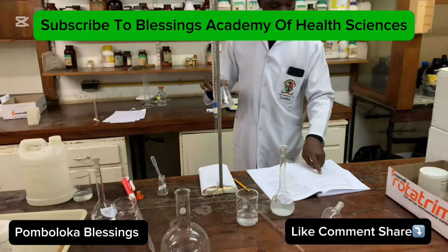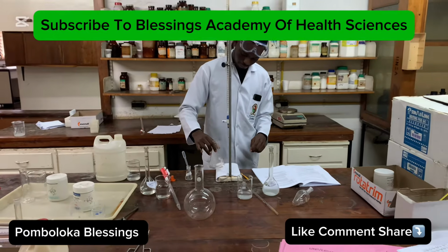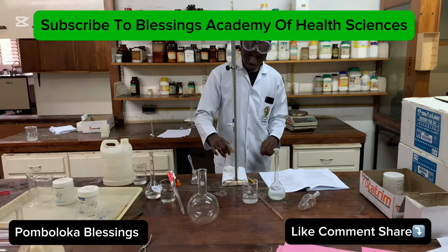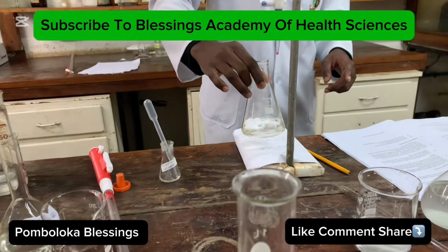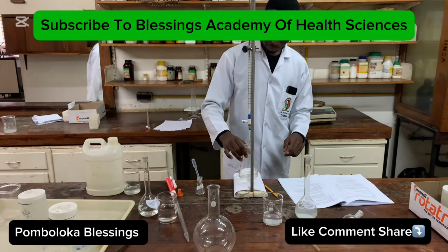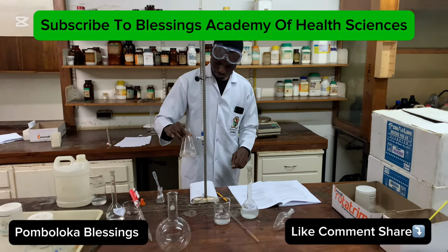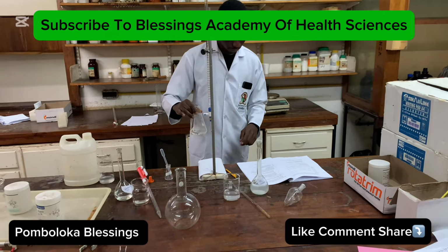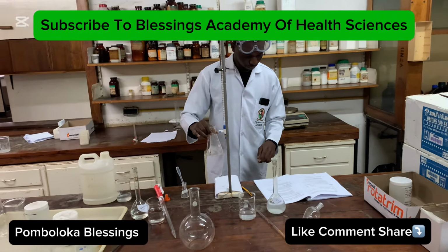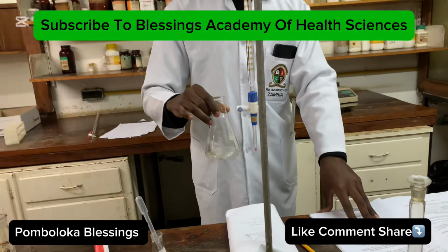So mix the mixture to react for about 5 minutes by shaking the flask slightly.